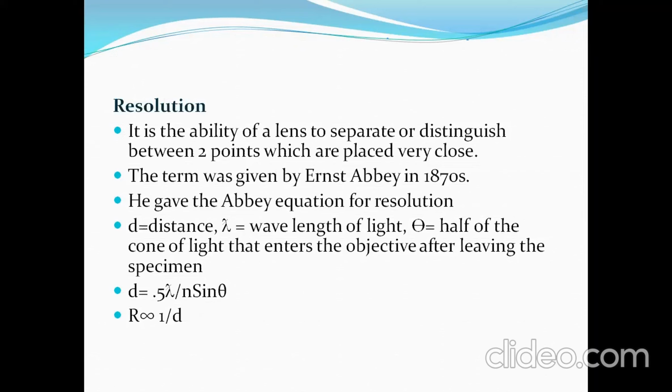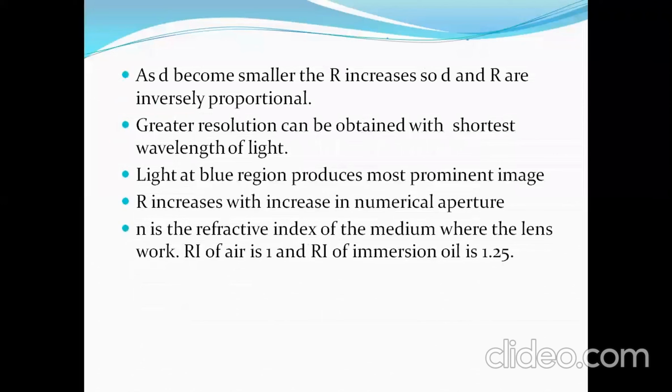And if we increase theta, again we can have a better image. So this is the basis of the resolution of any microscope. Whether we are getting a clear image or a blurred image, using this microscope or that microscope, depends solely on all these factors. This part I have already mentioned and discussed.